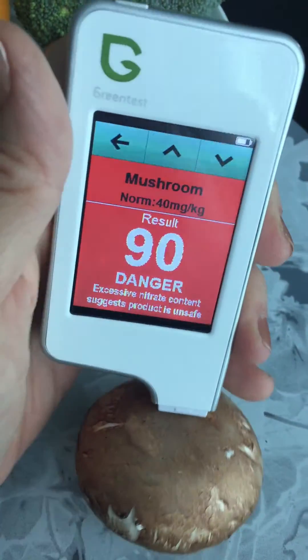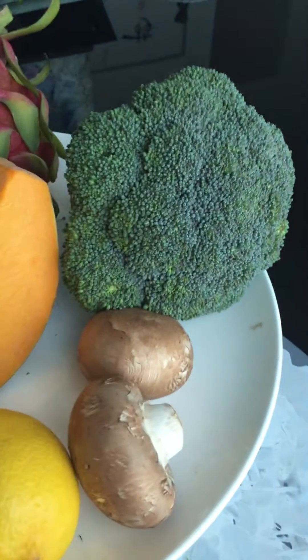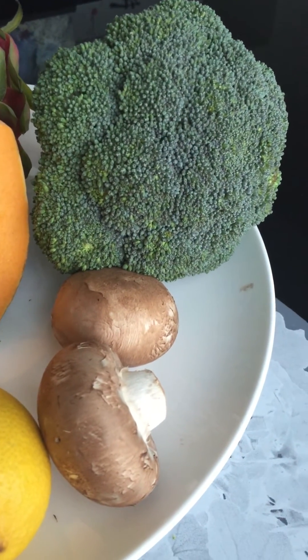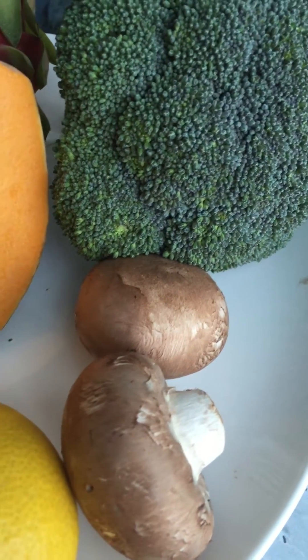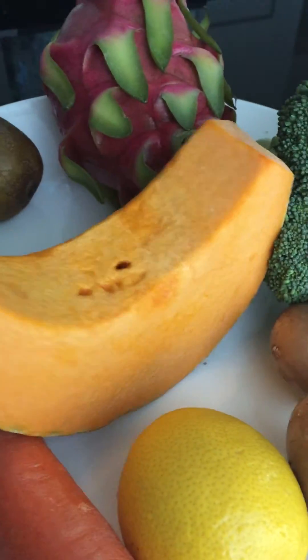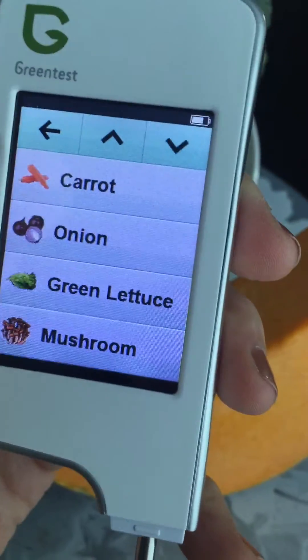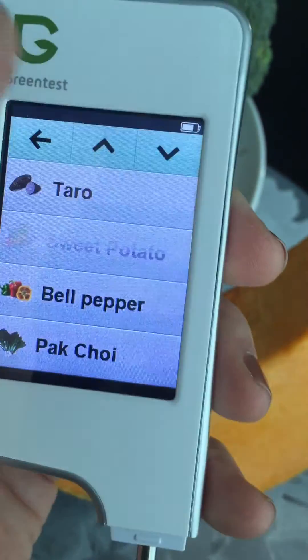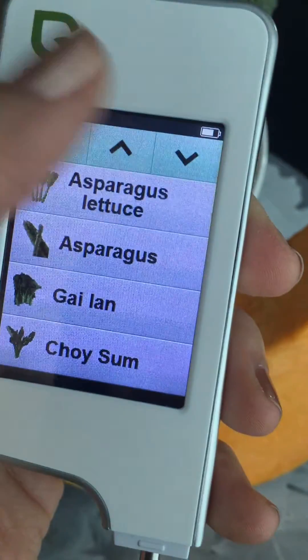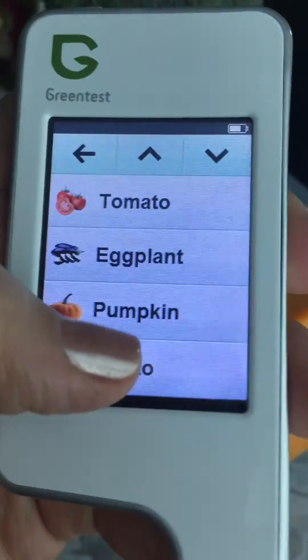Yikes! Are you convinced yet to spend a little more for organic? I've got organic on my tray here — not the broccoli unfortunately, it was out of stock, as I typically buy organic. The organic one is the pumpkin. Let's try the pumpkin — sorry, one-handed as I said — selecting pumpkin on the device.